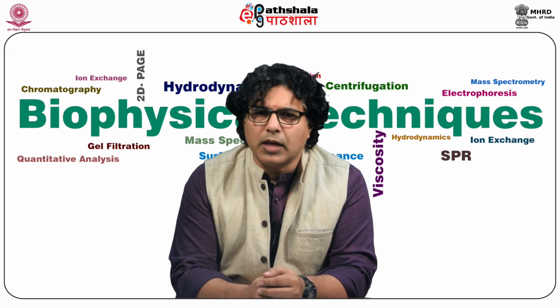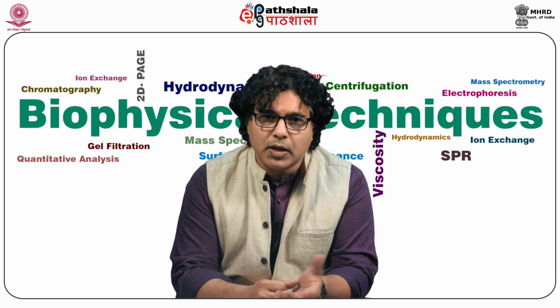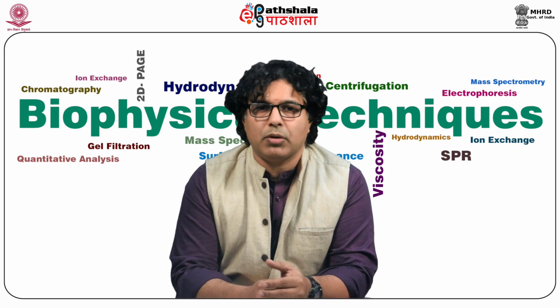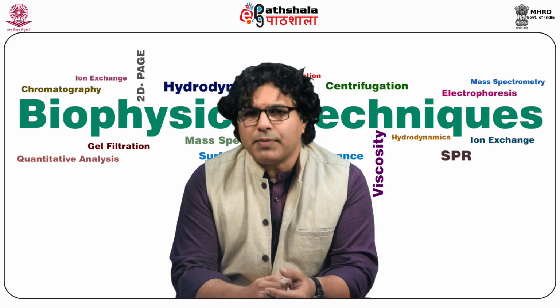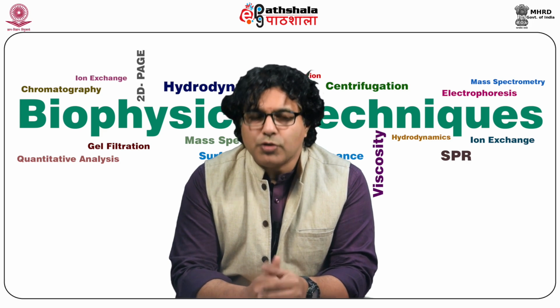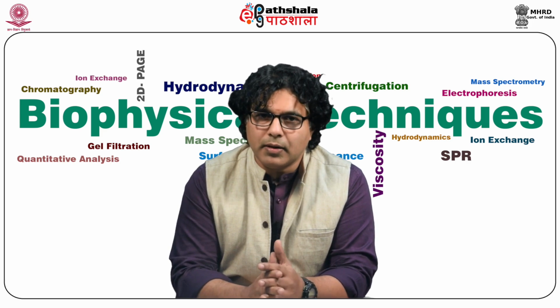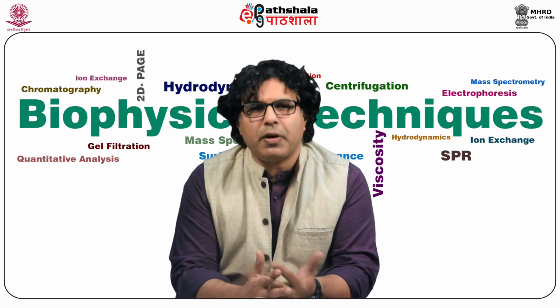We have small ultrafilters having different molecular weight cutoffs, which are used to selectively remove the subject, which is a molecule of your interest. Or sometimes we go for selective precipitation. For example, you take plasma. You try to remove the albumin as a major protein contaminant by using different methods.